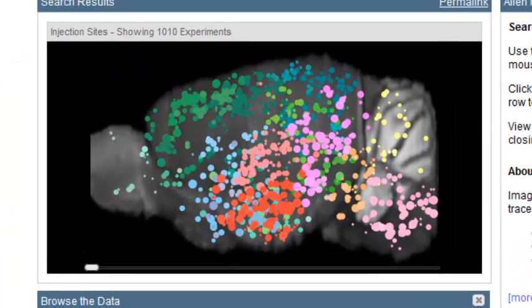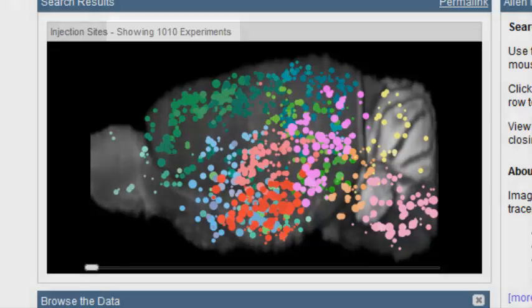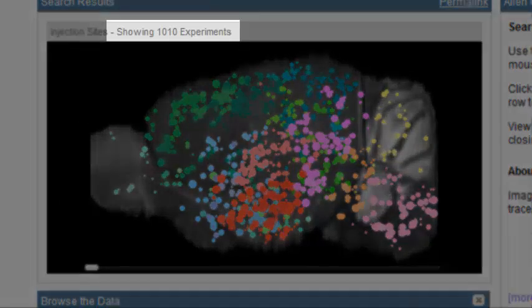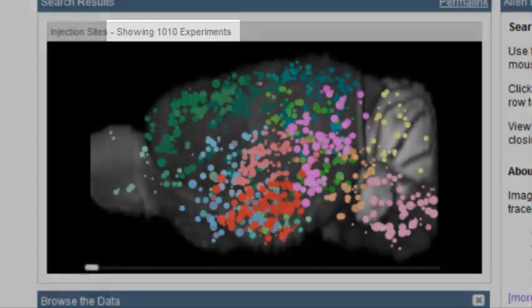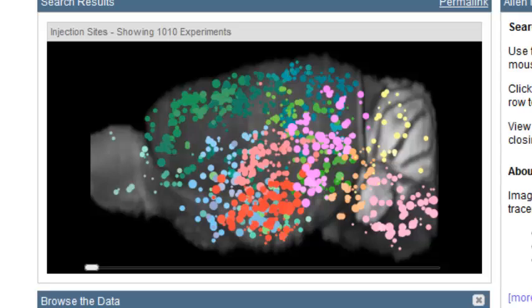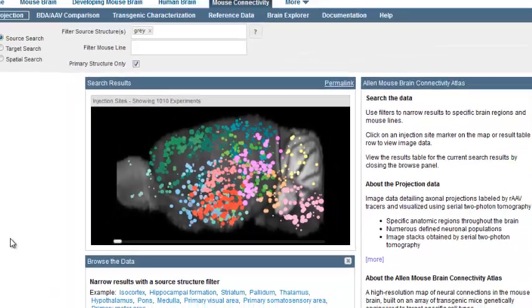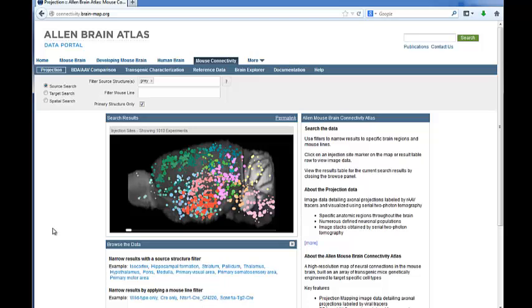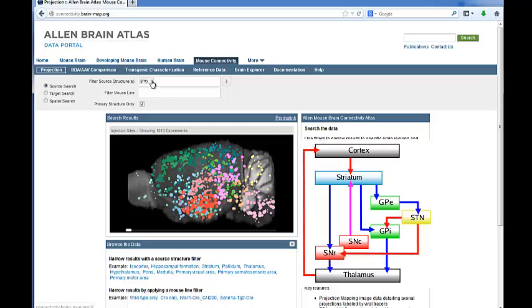By the June 2013 release, there were over 1,000 experiments online. Each experiment is represented by a sphere, with the size of the sphere corresponding to the size of the injection site, and colored according to the structure in the reference atlas.